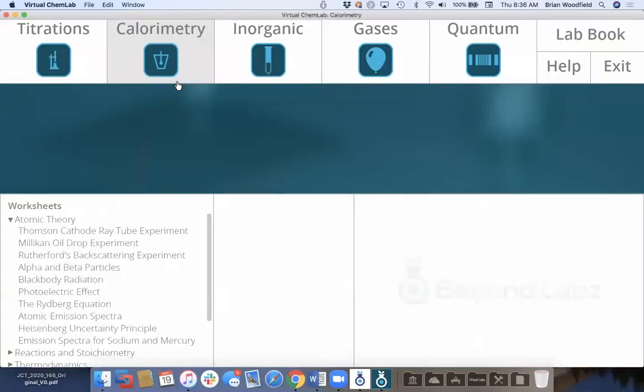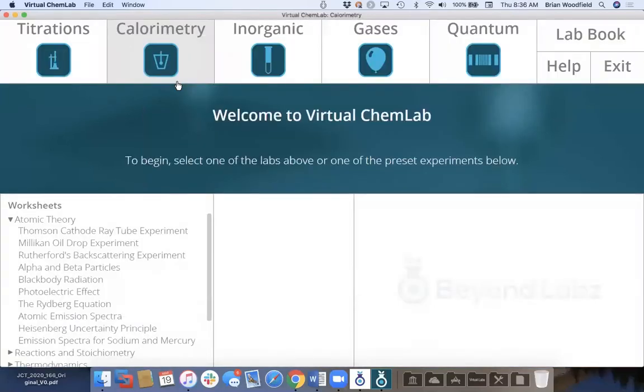So that's general chemistry. You can see that the level can be anywhere. It's not too hard for high school. It's really how you write the worksheets and the level, and it's really great for high school.